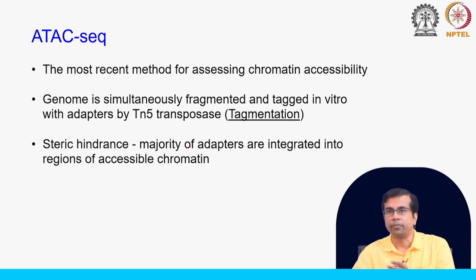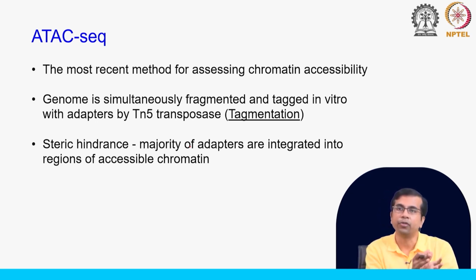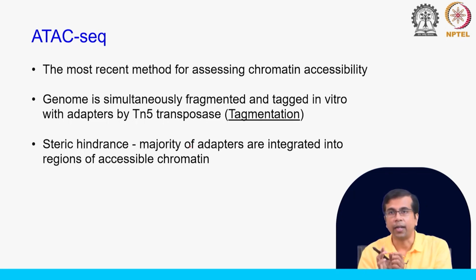What researchers have seen is that because of steric hindrance, this being a big enzyme, it can only access the sites that are open. If you have sites occupied by nucleosomes or transcription factors, and open sites, this protein can only access the sites that are open. Because of this steric hindrance, all these adapters will be integrated into the regions that are accessible, because of the property of these transposases. It will integrate these adapters into the genomic regions, but only where it can get access.